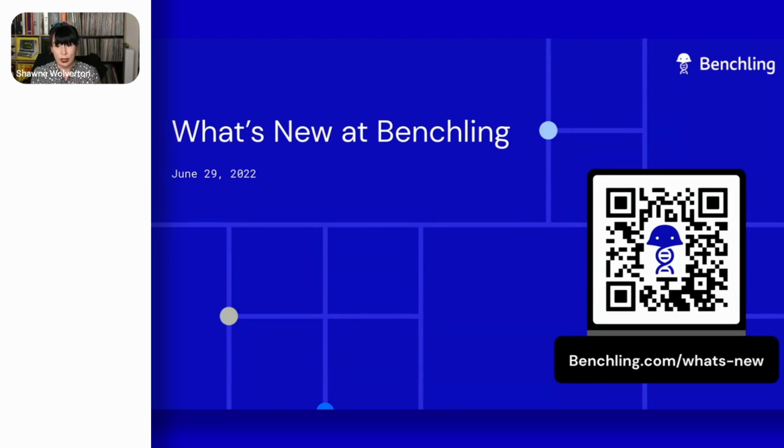And we know you're all very busy, so we're going to keep this tight and hopefully fun and interactive. Just an hour today to give you this update, but we're going to have some polls and Q&A, live demos. So please be encouraged and feel free to participate throughout the session.